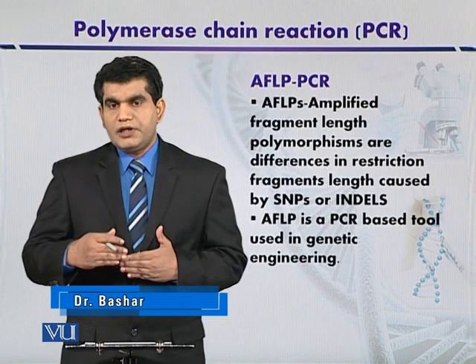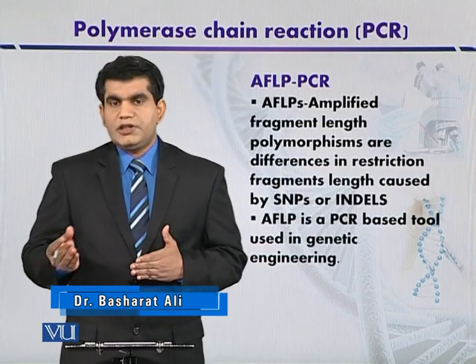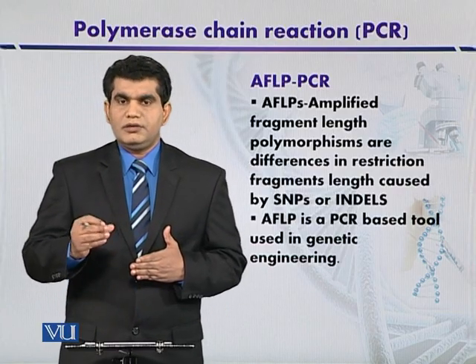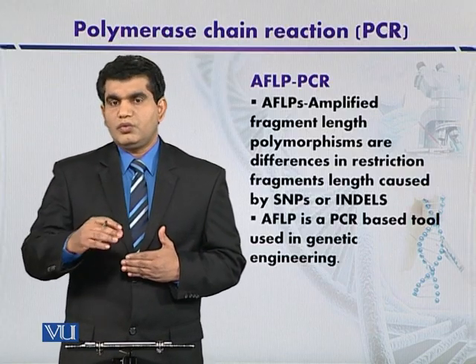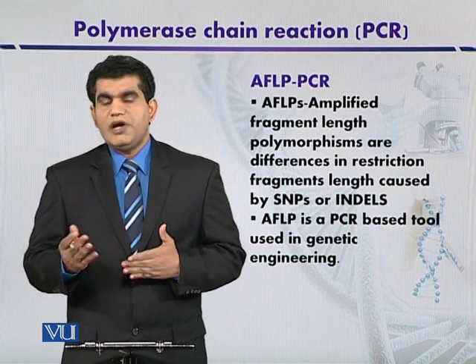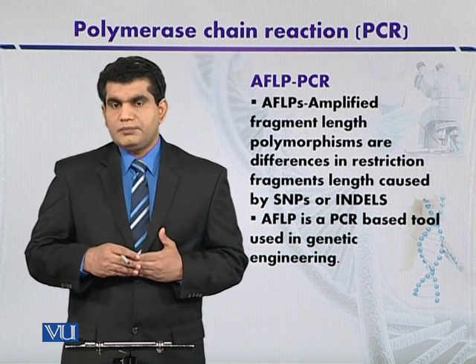लेकिन सम टाइम क्या होता है कि क्राइम सीन से जो सैंपल आता है वो जो टिश्यू है या ब्लड है उसकी कंसंट्रेशन बड़ी कम होती है, तो उसको ज़्यादा टारगेट करने के लिए, एम्पलीफाई करने के लिए वी हैव टू यूज़ द PCR technique.